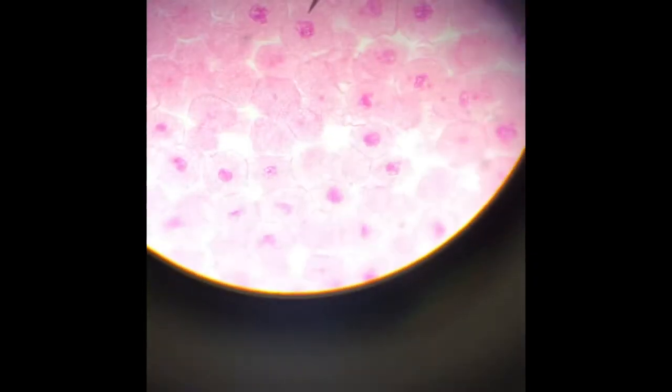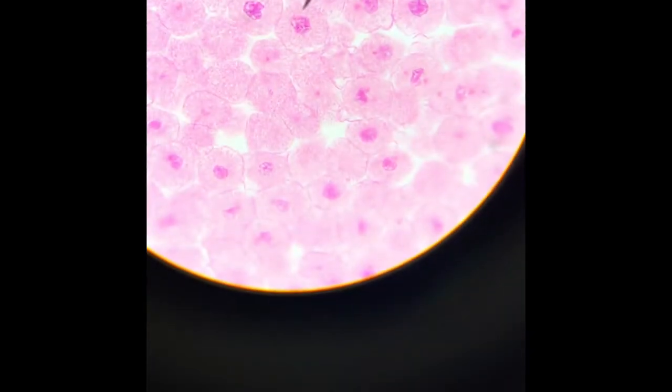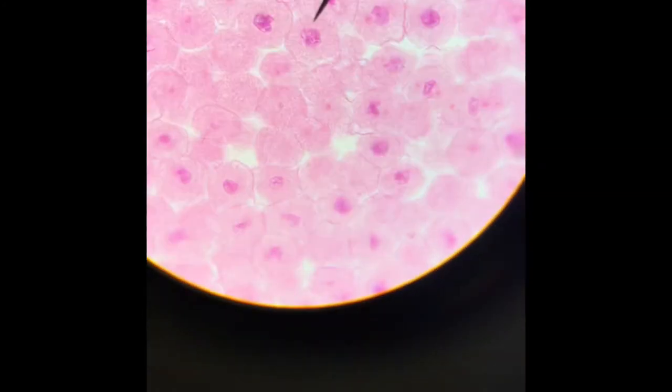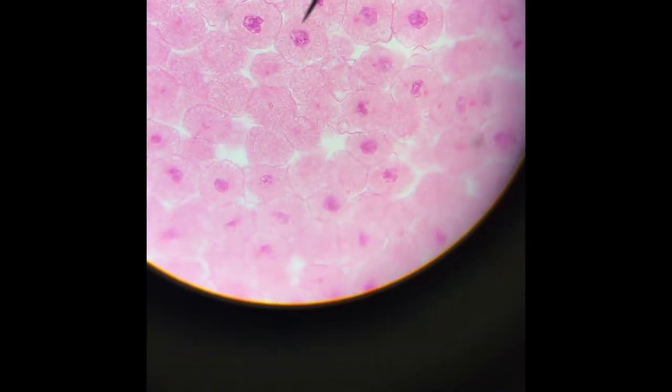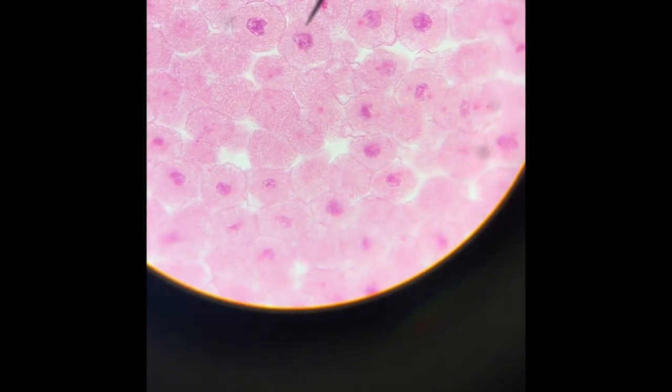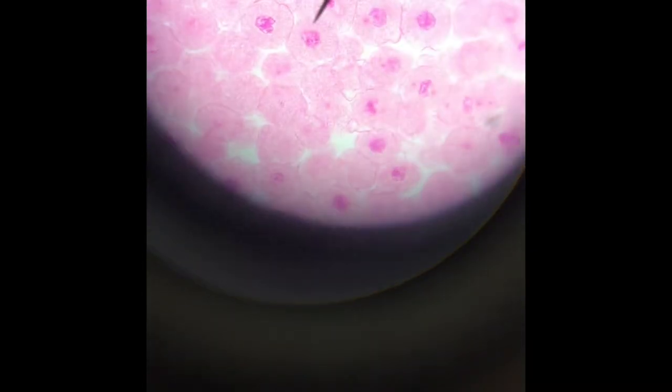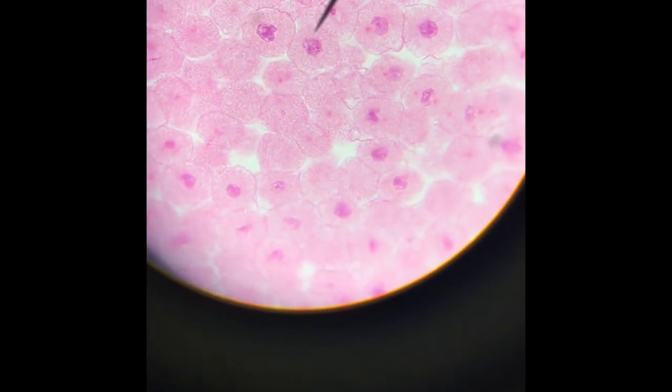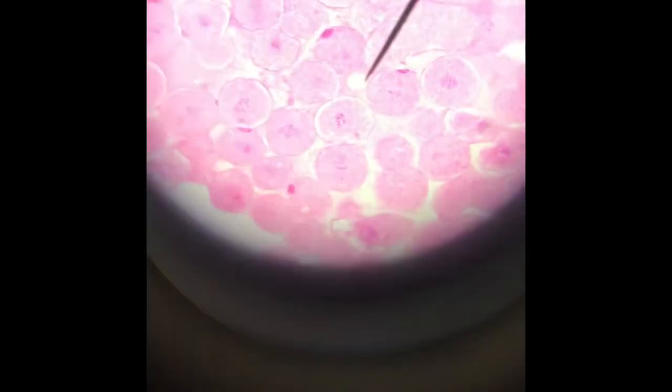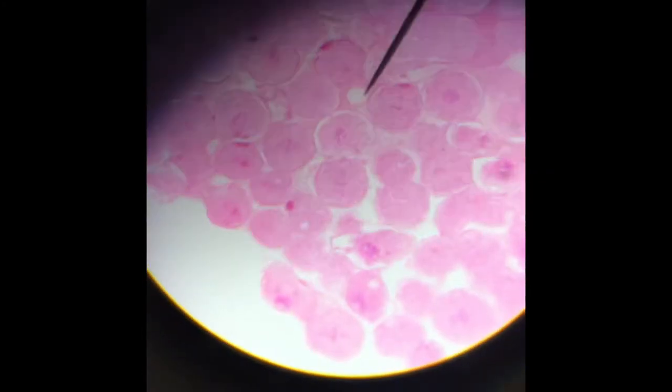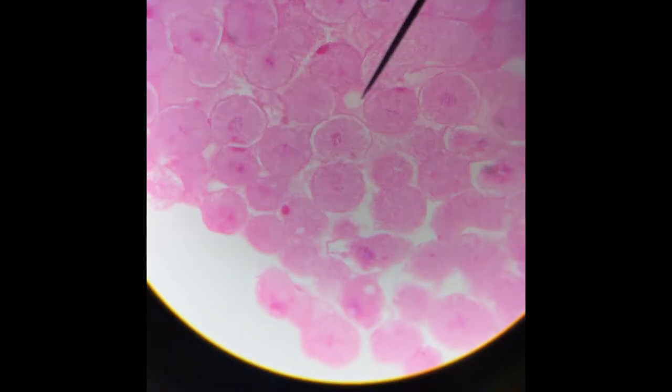Okay, I'm going to give you all one last view from the microscope in the classroom. Like I said, if you push pause, you'll see it a lot better. But these are really good. So you can have some cells to look at. Hang on. Ready? There you go. That is so good. And here's another field of view. I switched it around a bit. That's really good.